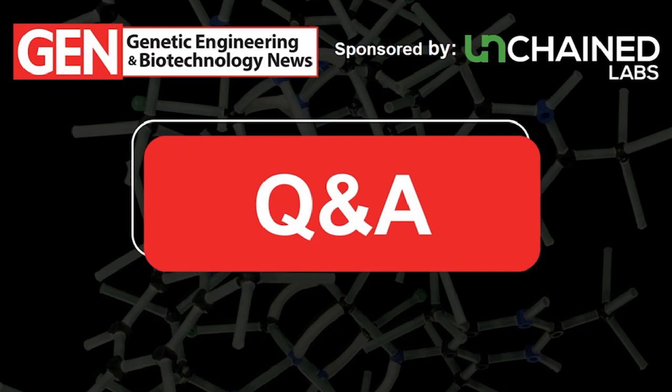All right, and we got another one here for you, Kevin. Audience member, Parminder actually, asks, can we use cesium chloride or iodixanol purified samples with Stunner?